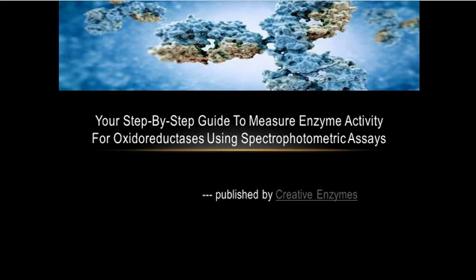Your step-by-step guide to measure enzyme activity for oxidoreductases using spectrophotometric assays. Published by Creative Enzymes.